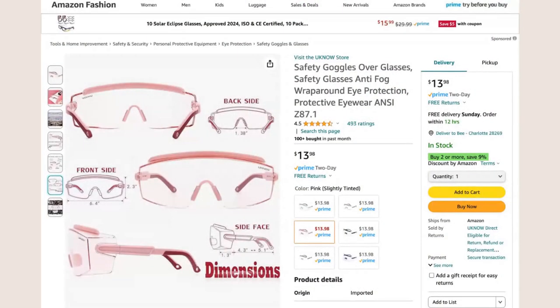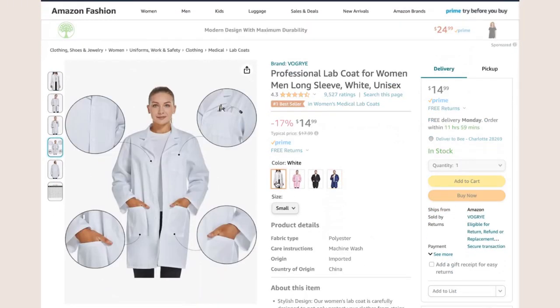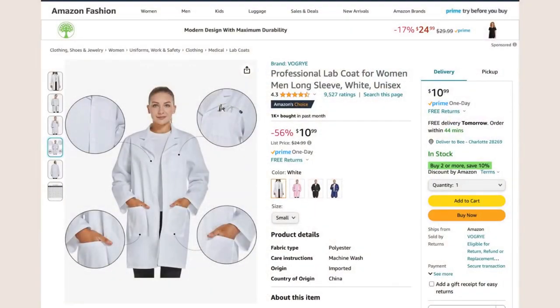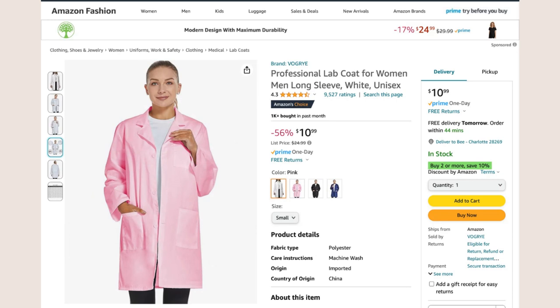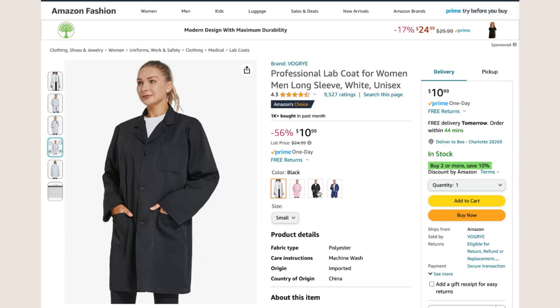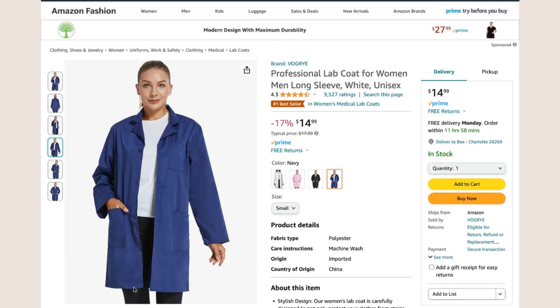In addition to goggles, PPE includes a lab coat. The lab coats you typically see aren't very stylish, but since it's going to be just me at home, I want to make sure I look good — I like aesthetic things. So I'm considering getting this navy one. It has great reviews. I also looked at pink and black, but I thought navy would be the best choice, so I'm probably going to add that one to cart.